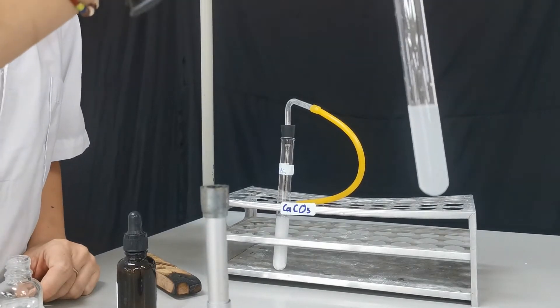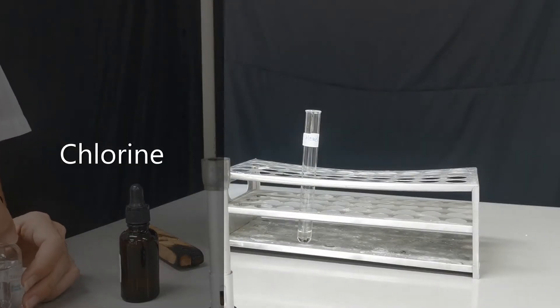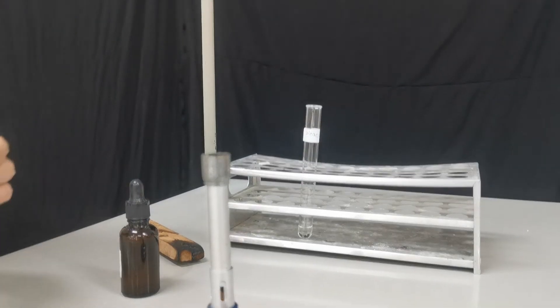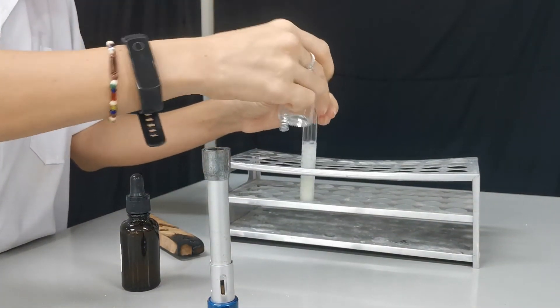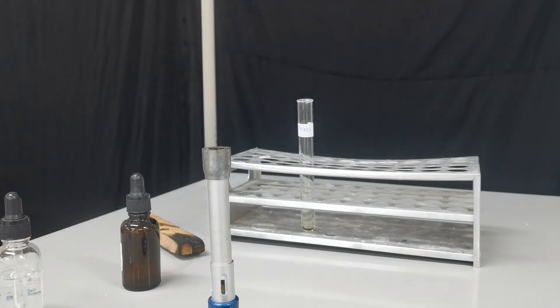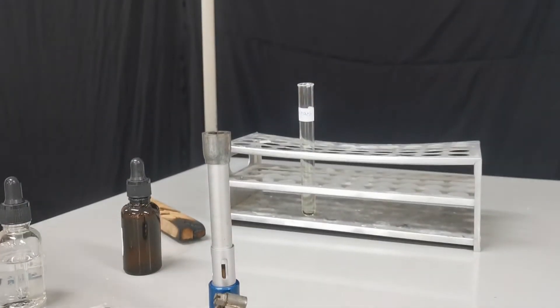The next test is for chlorine gas. We can react bleach with hydrochloric acid and warm it up to produce chlorine gas. You can see that actually no warming is needed anymore, and we're going to test it using damp blue litmus paper.